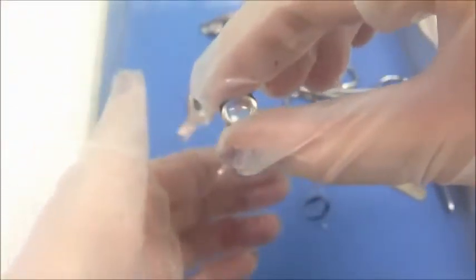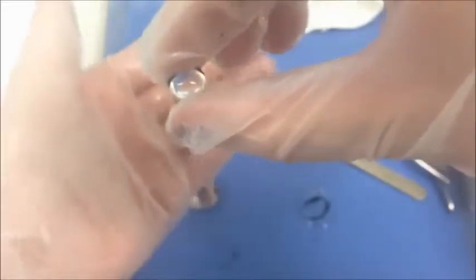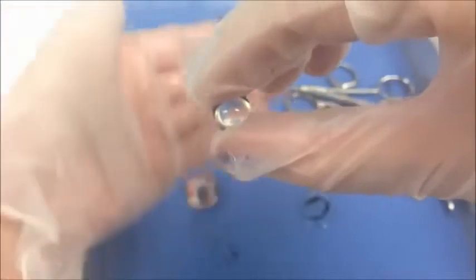If you look through the lens, everything should be upside down. You can see my hand through the lens but on the opposite side. The lens can be stretched to be made thin to see objects far away, and then go fatter to see objects closer by.